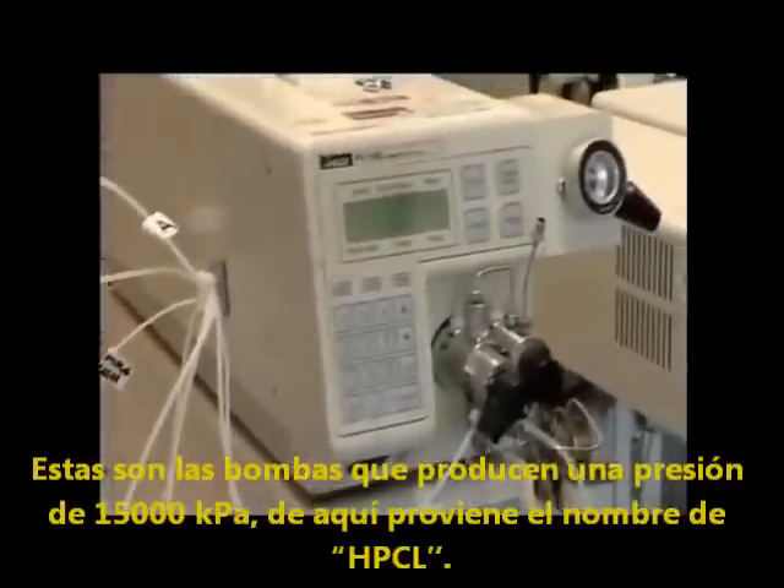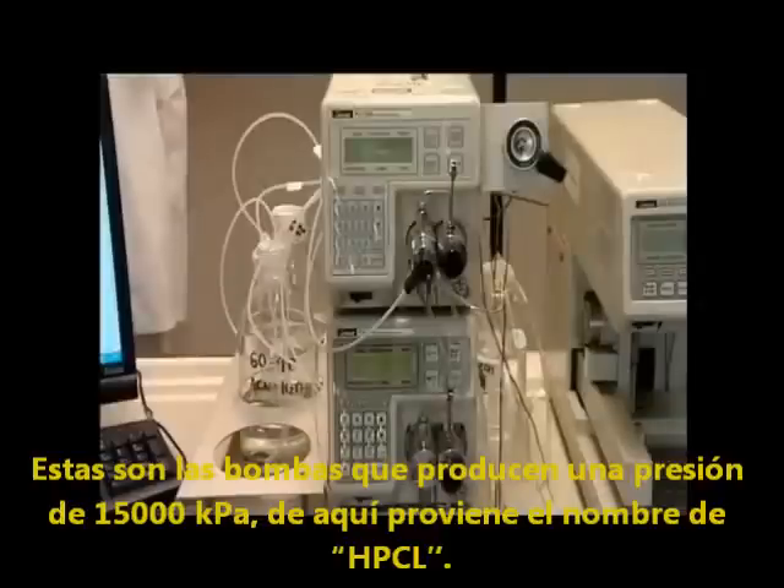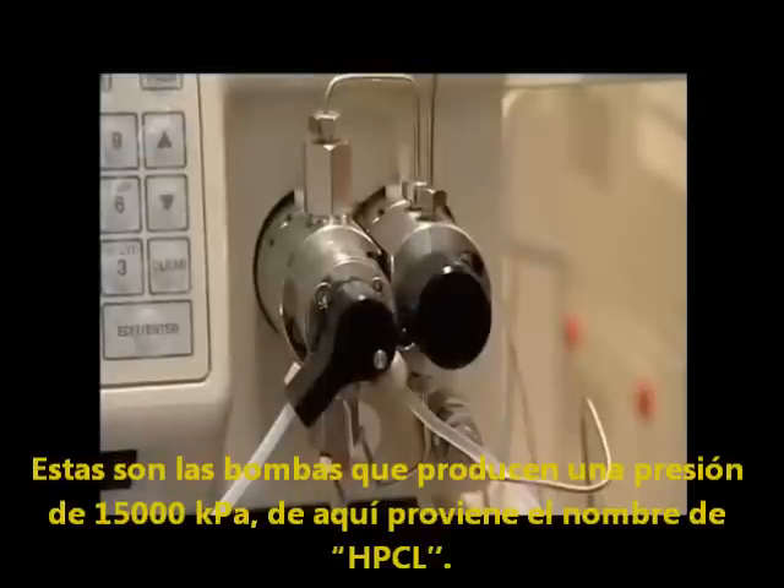These are the pumps. They produce a pressure of 15,000 kilopascals, 150 times that of the atmosphere, hence the name, high pressure liquid chromatography.